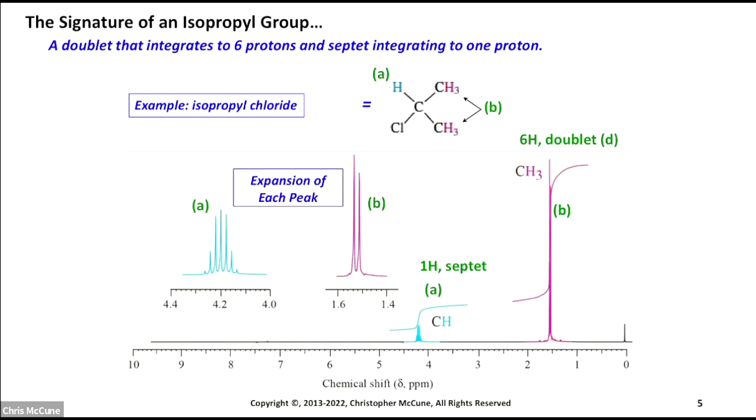And this is going to be actually a CH3. Let's write it like this, so it's not so confusing. We'll write it like that. So that's the isopropyl CH3s, and so you can kind of just fragment a piece like that. And so that's where we're getting that doublet from, and it's integrated as 6 hydrogens. So you know that those CH3s are equivalent.